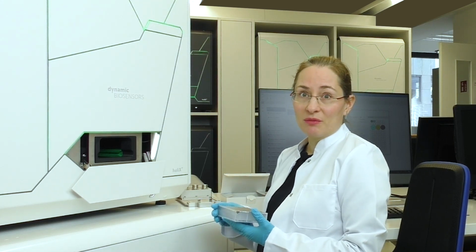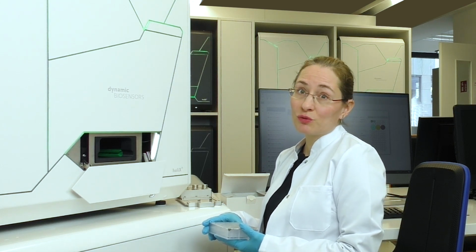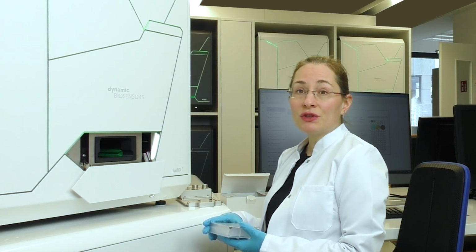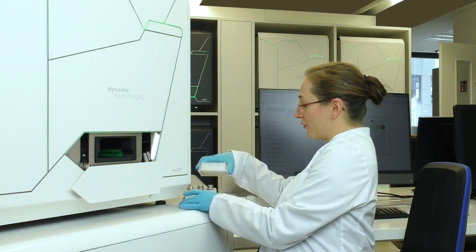The multiplex DNA binder kit contains the ligand DNA mix and the analyte T7 polymerase. I have to make sure to put them into the indicated locations, or I could modify the sample positions by drag and drop in the software. I'm inserting the 96 well plate with the analyte into the autosampler tray first.